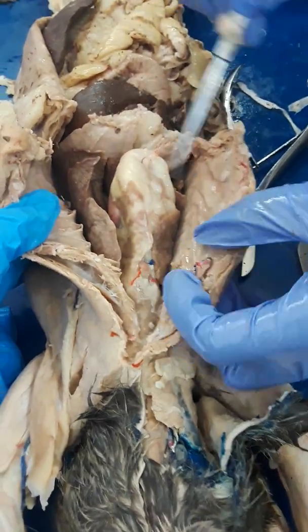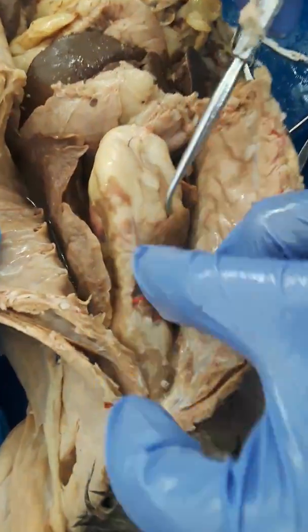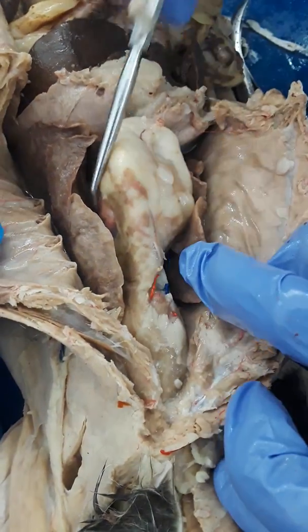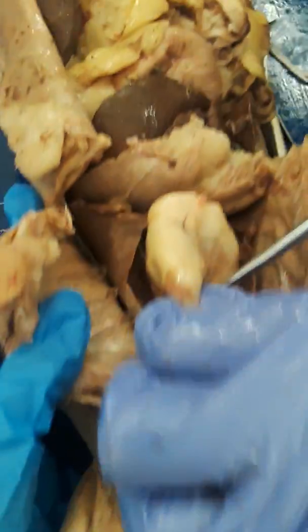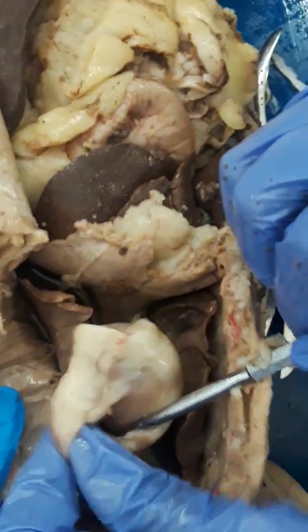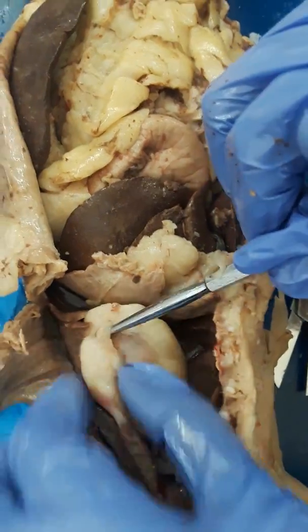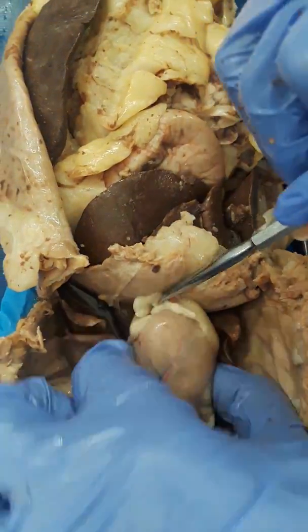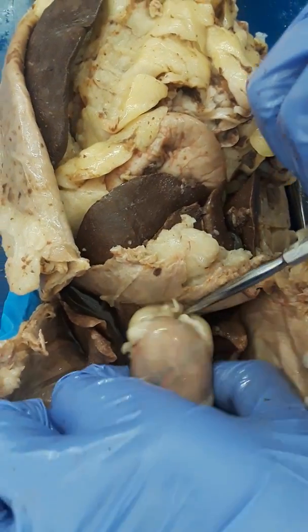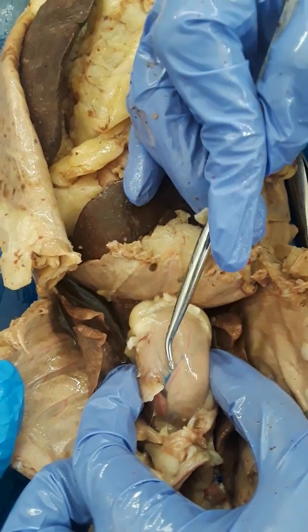Ta-da, go. So thoracic cavity. Within the thoracic cavity, we have the lungs, which are on both sides. And then on top of the heart, this is going to be the thymus gland. It's here. So I'm just going to remove the thymus gland, expose the heart. And then on top of the heart, you can see the blood vessels that are red and blue.